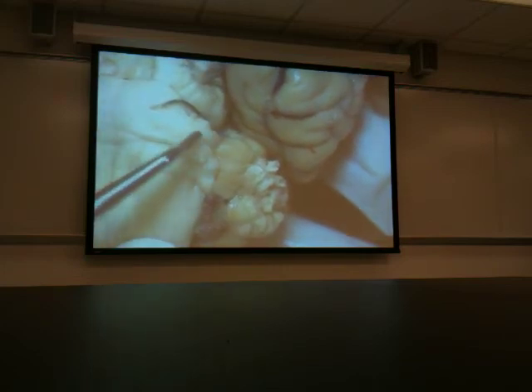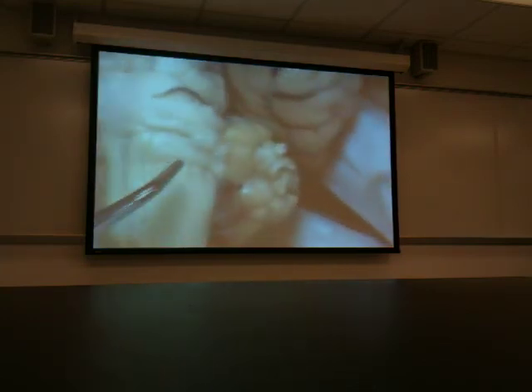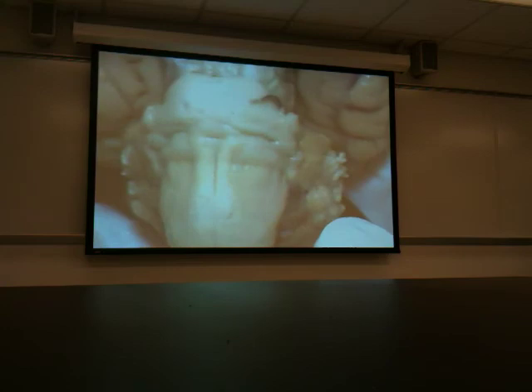And there's the stump of the trigeminal. Alrighty? And then what was the other one? Auditory. Yeah, right there. Thank you. All right. You can see that peeled back, the white is dura mater for sure. It looks like the arachnoid is peeled back as well.